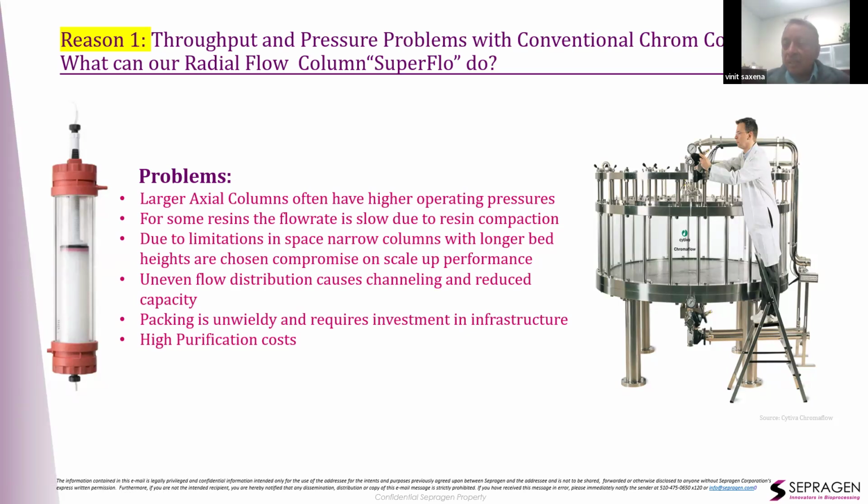The fact of the matter is that with membrane separations, which have next to no bed height, you can get adequate ion exchange. You're going to get adequate bind and elute separations, affinity, ion exchange, like that.